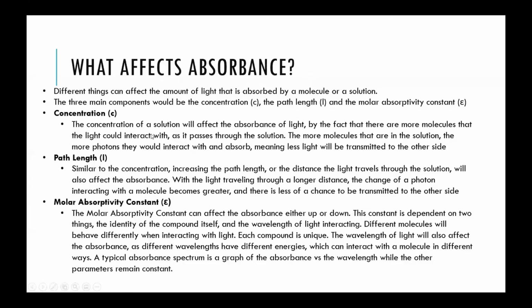The reason for both of these is that in either case, the light trying to get through from one side of the container with the solution to the other will need to pass through more molecules, either in the form of a higher concentration of molecules in the same distance, or it has a greater distance to travel, thereby increasing the chance that it's going to hit one of these molecules.